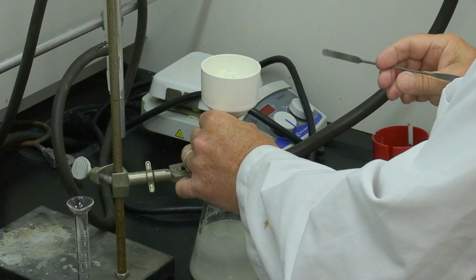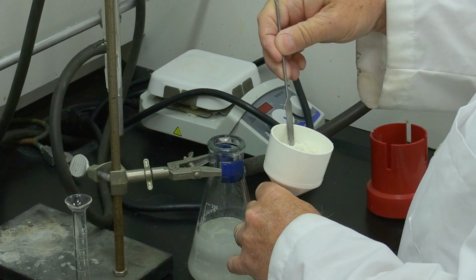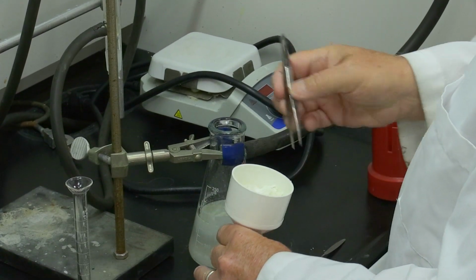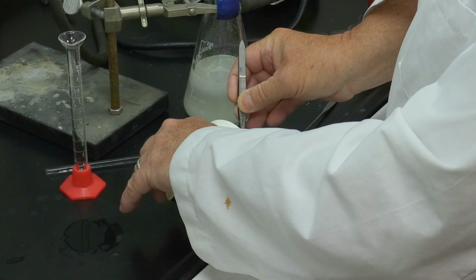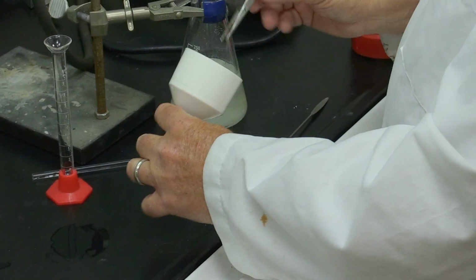This is part B of the Benzyl Fluorene. There's a lot of stuff here. A lot of good product.